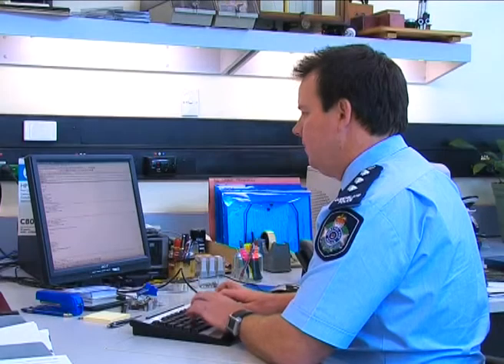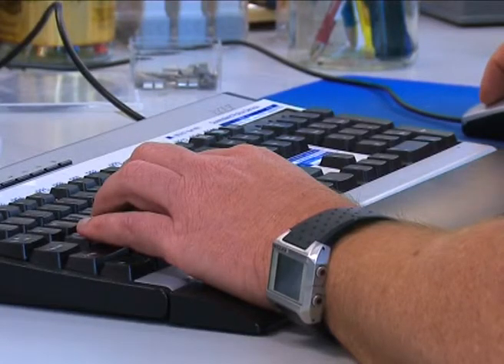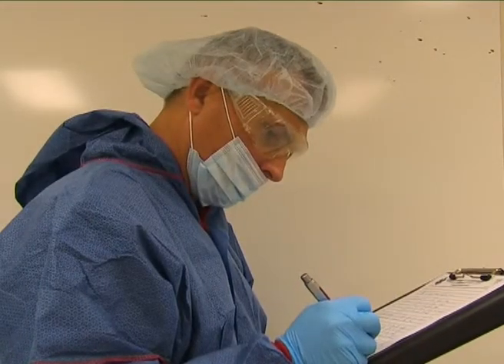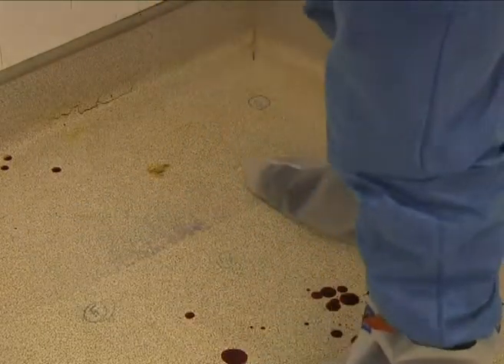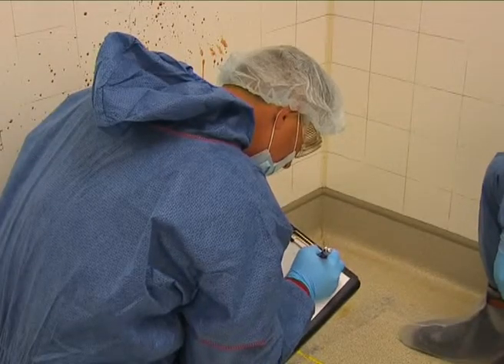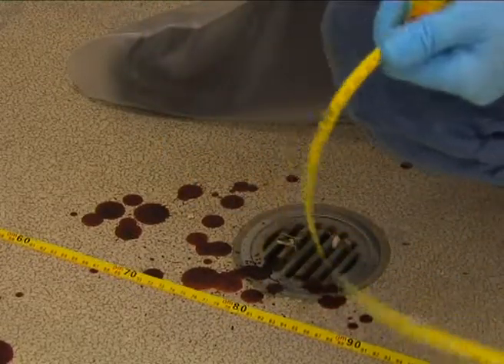A report will be prepared based on the analysis of the DNA evidence. If there are any other aspects that are in doubt, the scientific officers can reconstruct the crime scene in this blood splash room. In this case, the Royal Brisbane Hospital has confirmed that the victim was stabbed 2 times in the abdomen, which matches the bloodstain pattern analysis at the crime scene. The next task in the scientific department is to try to track down the type of shoe that the offender was wearing.